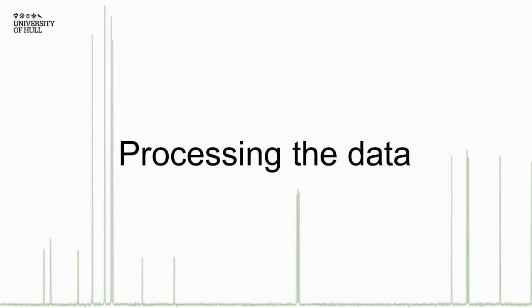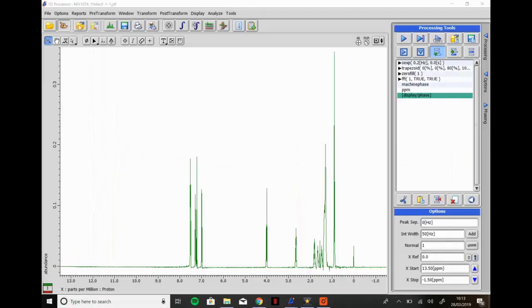The next thing we're going to talk about is processing 1D data. This is not supposed to be a set of detailed instructions, as there is already a video on the Canvas page that shows us how to do this.